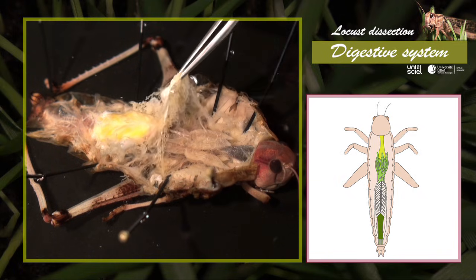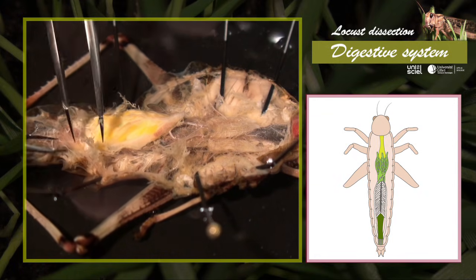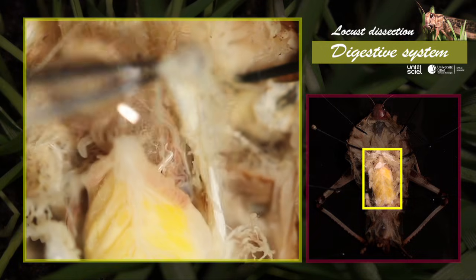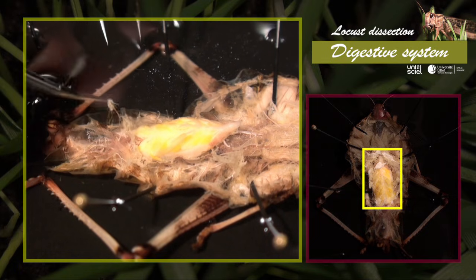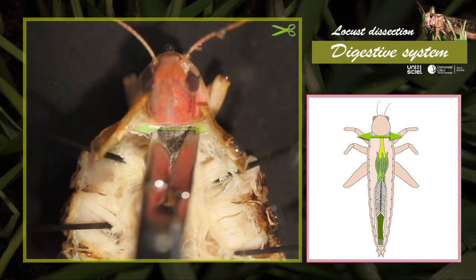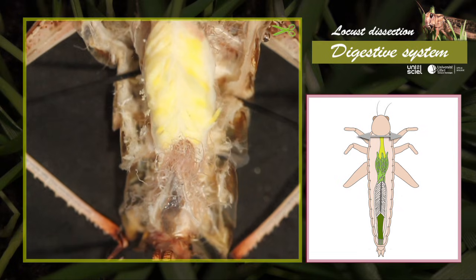Remove the tracheal sacs and most of the tracheae surrounding the intestine. Take out also most of the fat body spread in the hemocoel. Carefully remove the tracheae around the gonads. Cut the digestive tract at the level of the esophagus and at the rectum.